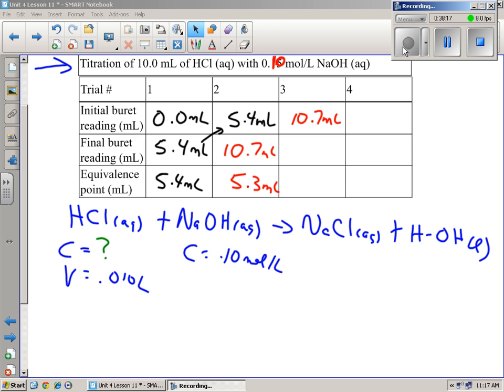I got one more drop here just kind of hanging on there. So I'm just going to use a little bit of water here, I think, and get that off of there. Water is not going to affect it. Okay, you're adding water anyway. So yeah, that was probably the drop that we needed. You saw 1 drop was kind of clear. This is 1 extra, not even a real drop. So like I said, it's very hard to duplicate that right now because of indicators and the type of acid and base I'm using. So probably a little too dark, but that's okay. Let's take the measurement here. 15 point. I'd say 15.9-ish.